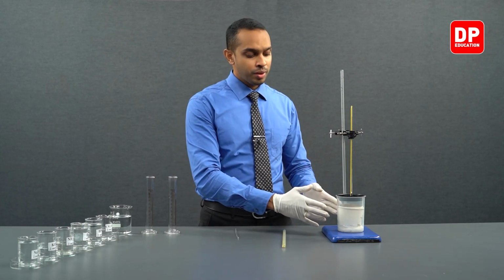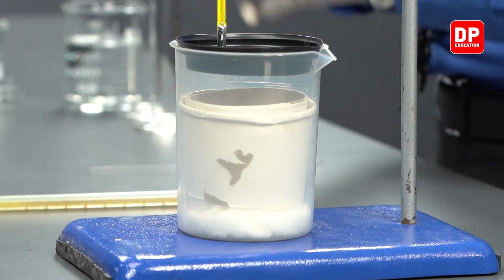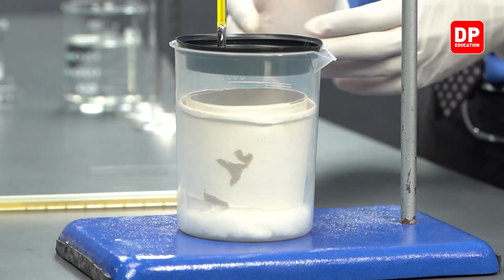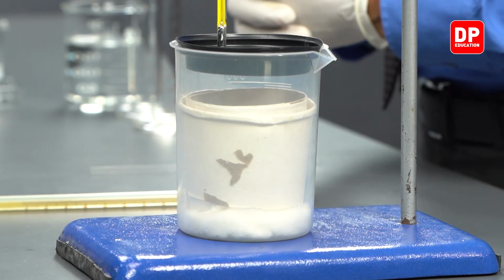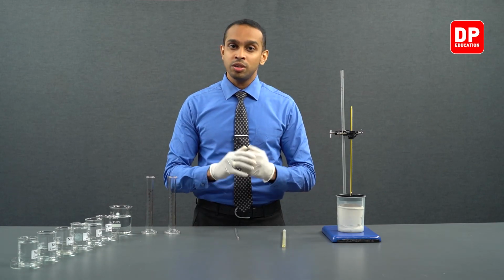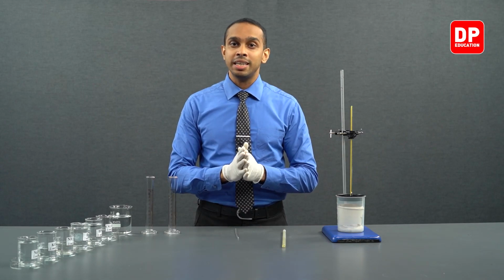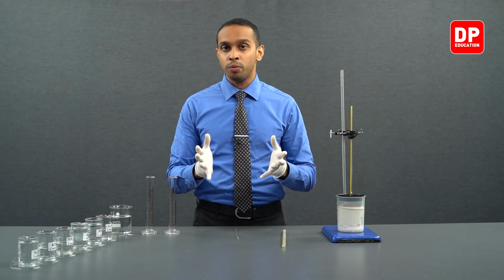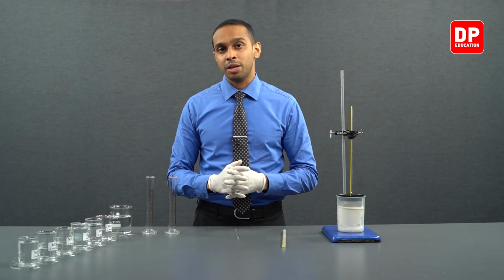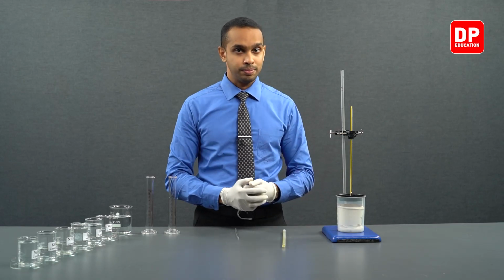What you see here is a plastic beaker, and inside the plastic beaker we have another plastic beaker with some insulation inside of the beaker, so that whatever heat is released or absorbed remains inside the system, and we do not release any heat towards the surroundings, or absorb heat from the surroundings when we are conducting the experiment inside this setup.